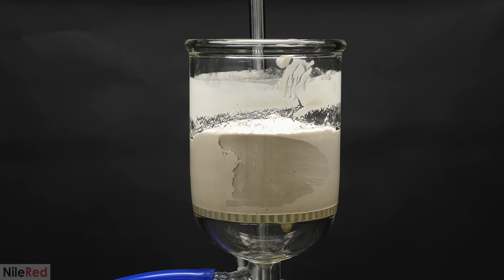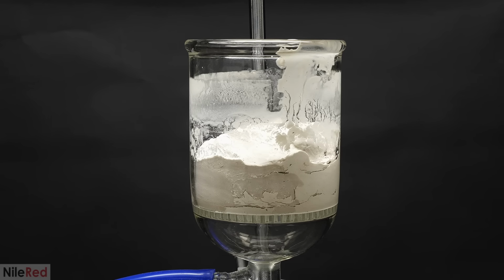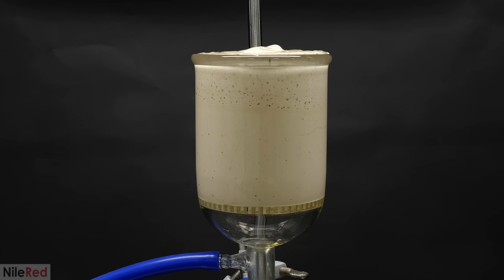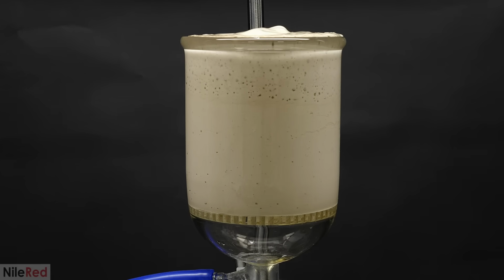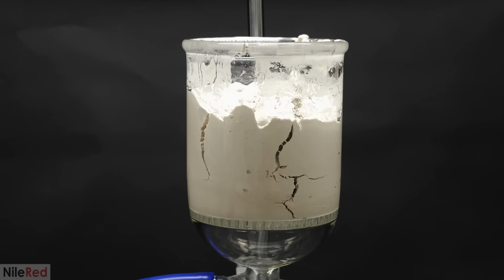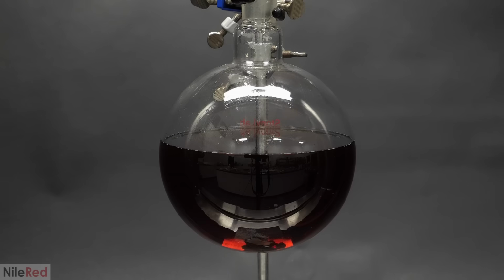This was then all pulled through, and I washed it a second time. Now I had to deal with the other half of the stuff, so I washed the filter and I added everything that was left in the beaker. It was all just barely able to fit, and I turned on the vacuum. Just like before, I pulled it all through and I washed it twice with some water. In the flask below, I was left with a bunch of dark liquid.